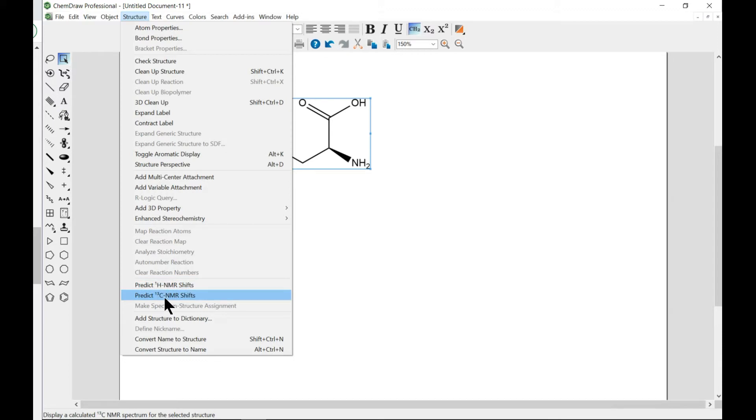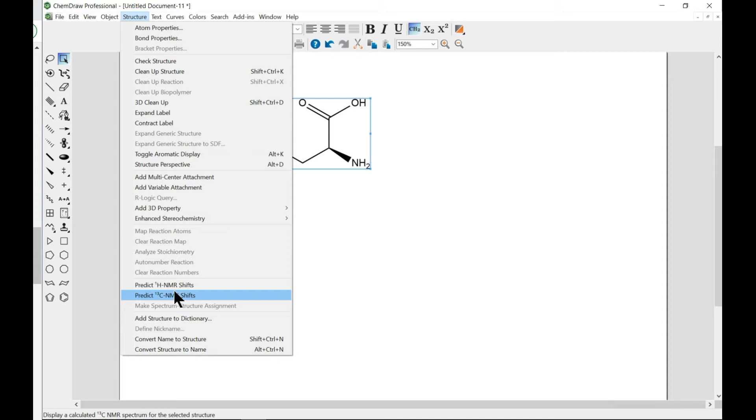Following an order, it first identifies the key substructures of the molecule and a substructure provides the base value for the estimated shift. For example, if you have benzene, benzene could be the substructure for trinitrotoluene, something like that.